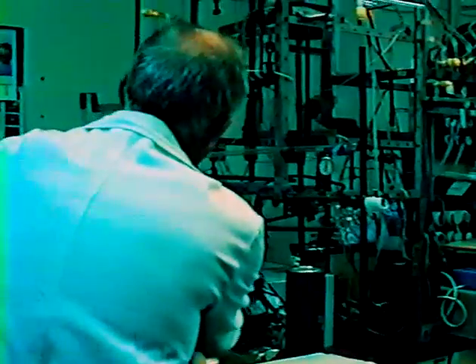Well, you have seen such a kind of infrared cell already in the upper part of our experiment. Right now, Tamás is investigating the adsorption of methyl halogenides on palladium again, and sometimes he is doing experiments on the adsorption of methane, carbon dioxide, and methane-carbon dioxide mixture.